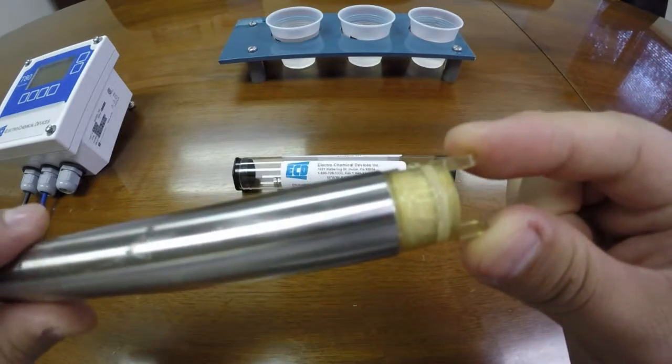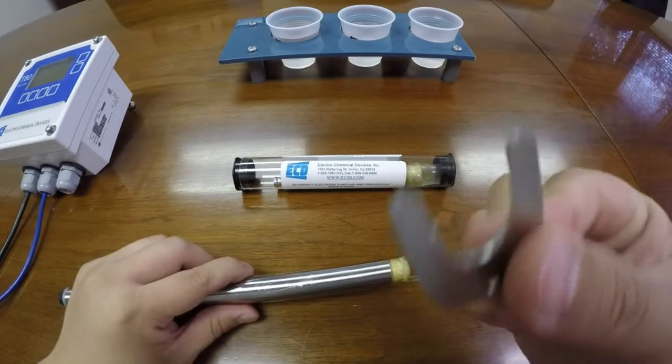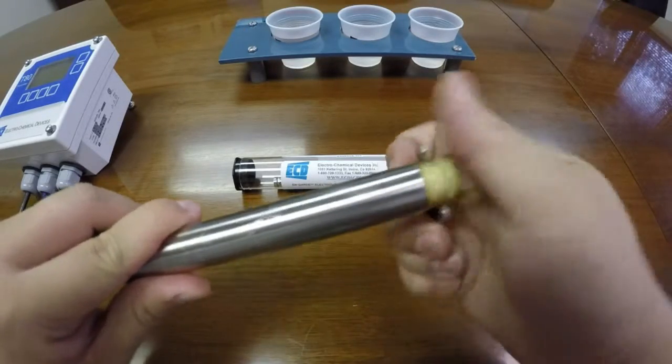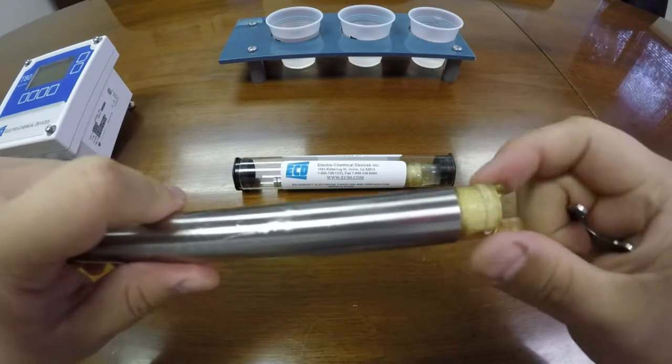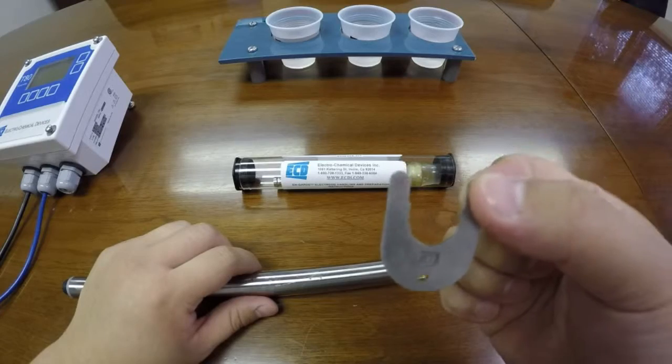If you take a look at the electrode, there will be cutouts. These cutouts are so that the electrode wrench has a place to fit to loosen the electrode from the S80 body. If one is not provided, please contact the factory for purchase.